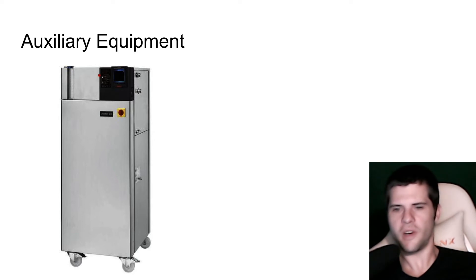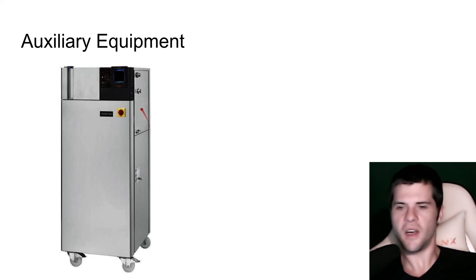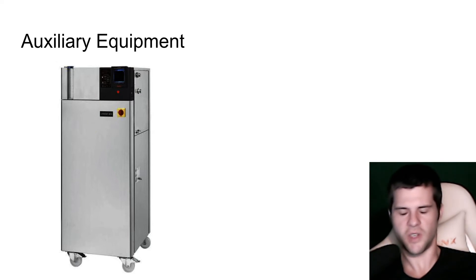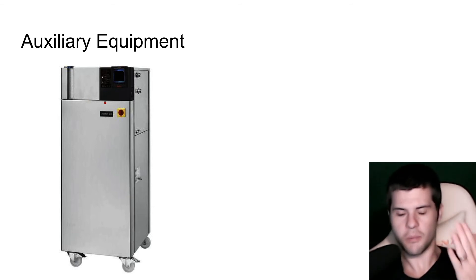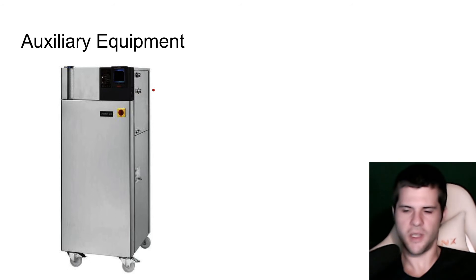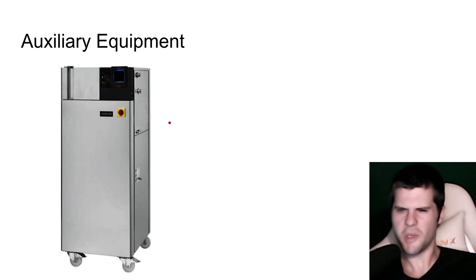What this is for is regulating the internal temperature on the glass reactor via the inlet and the outlet. It will pump that circulating fluid in there and hold whatever temperature you've programmed so that your reaction is under controlled temperature. If you're using a glass reactor, the chances are you'll always need a piece of auxiliary equipment. This is just my favorite one — Jalabo makes some, USA Lab makes some, you can find them all over the place. It will also cost you about three times the amount of what the glass reactor costs you, so however you weigh that is your choice as the business owner or technician.